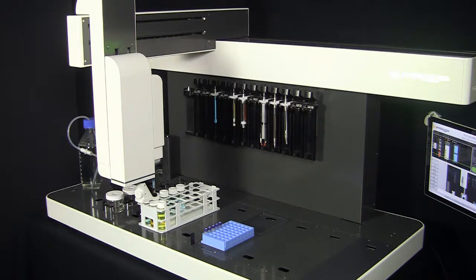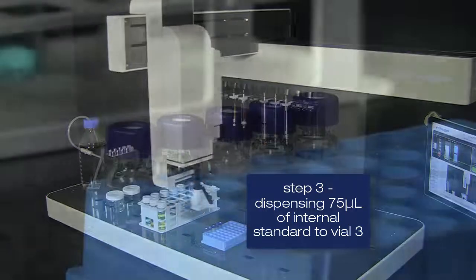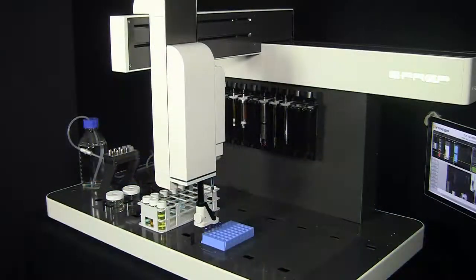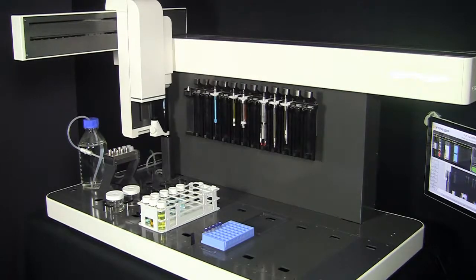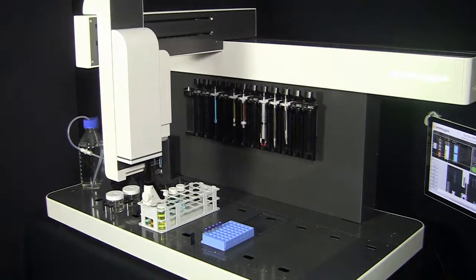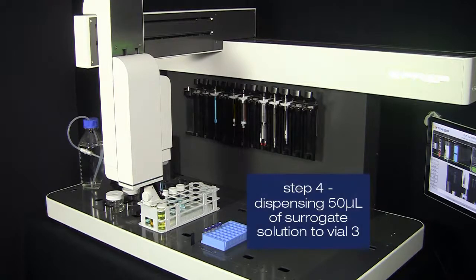The third task is the syringe aliquots 75 microliters of internal standard into the same vial. The fourth task is the syringe aliquots 50 microliters of surrogate solution into vial 3.